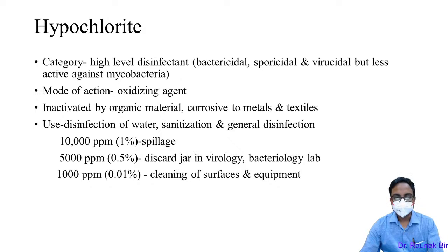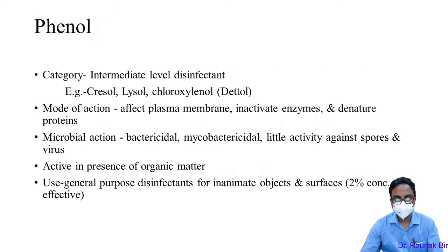For discard jars in bacteriological labs, use 0.5% (5,000 ppm) hypochlorite. For cleaning surfaces and other equipment, use 1,000 ppm (0.1%).